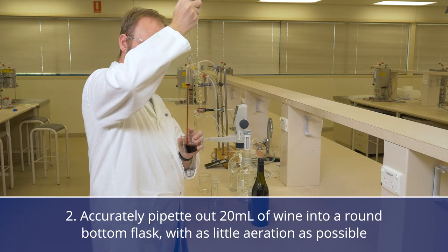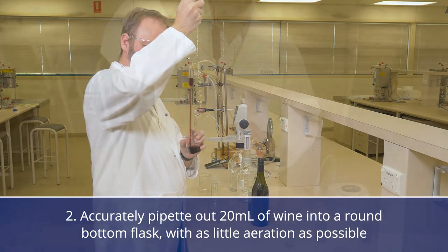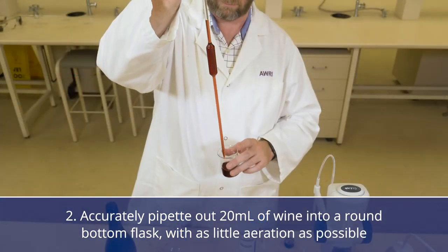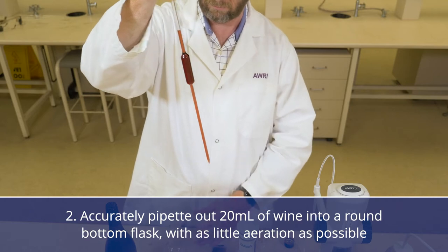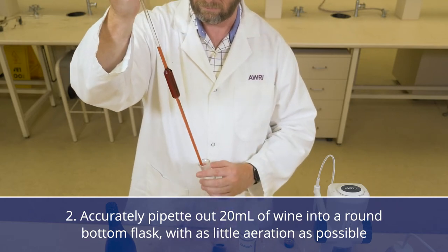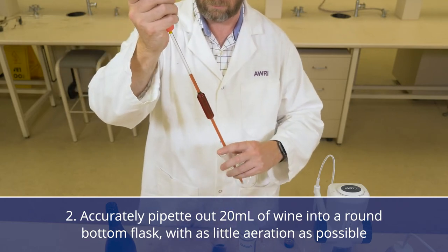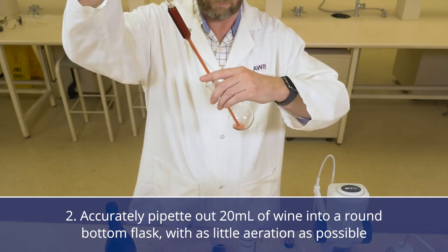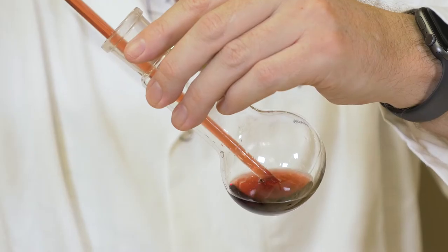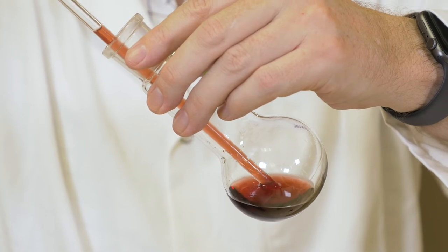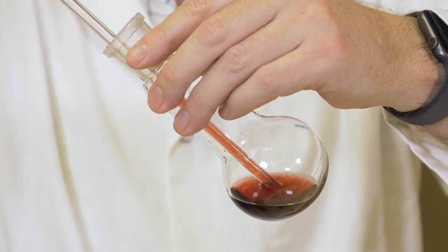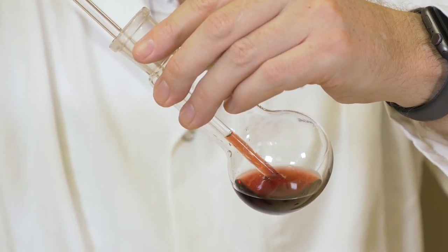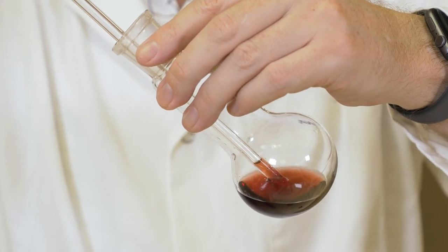The next step is to accurately pipette out 20 mL of wine into a round bottom flask. It is important to do this with as little aeration as possible to ensure that no sulfur dioxide is lost during the procedure. Keep the tip of the pipette below the liquid surface as you empty it and then drain the pipette by holding the tip against the side of the flask.